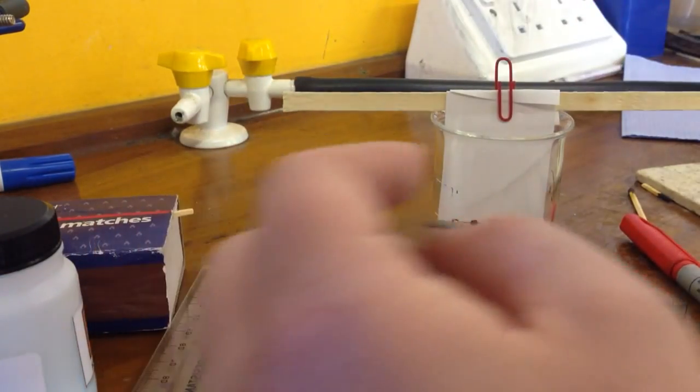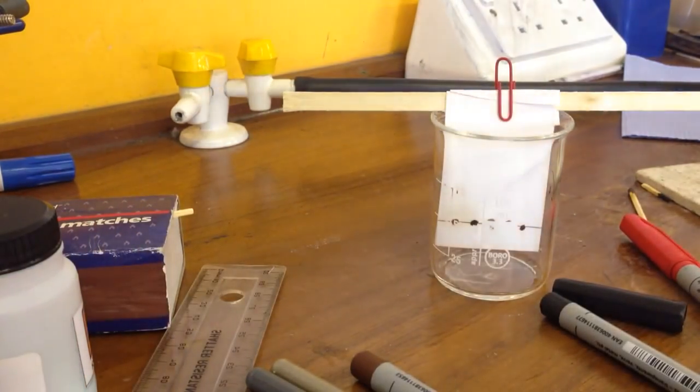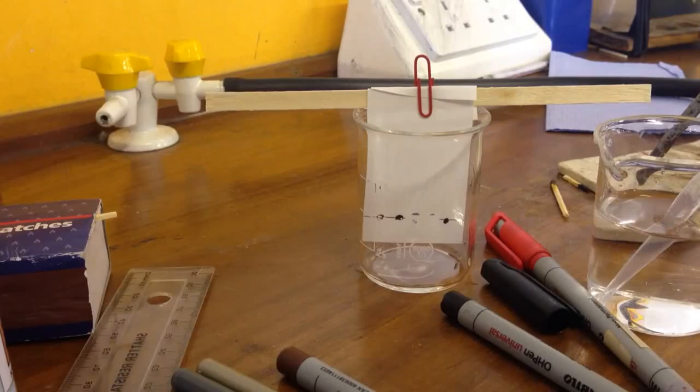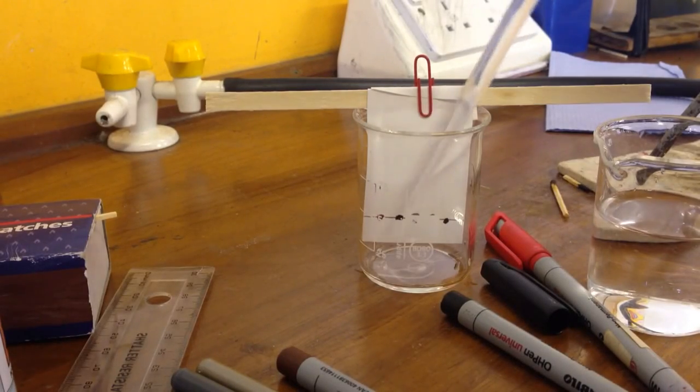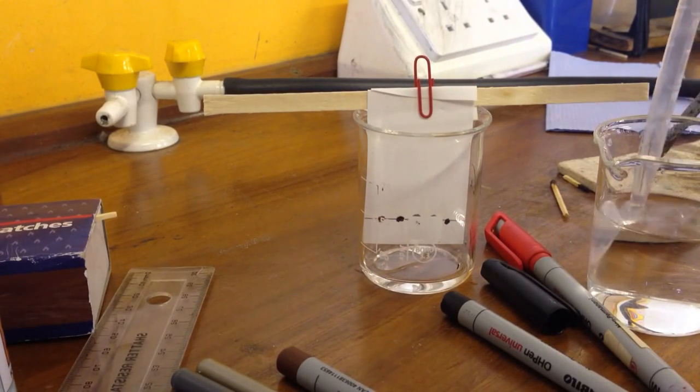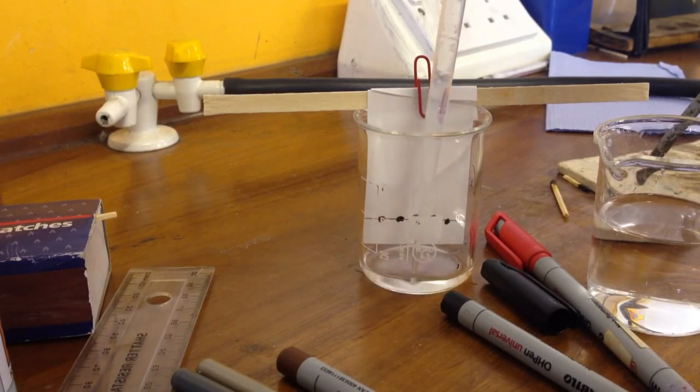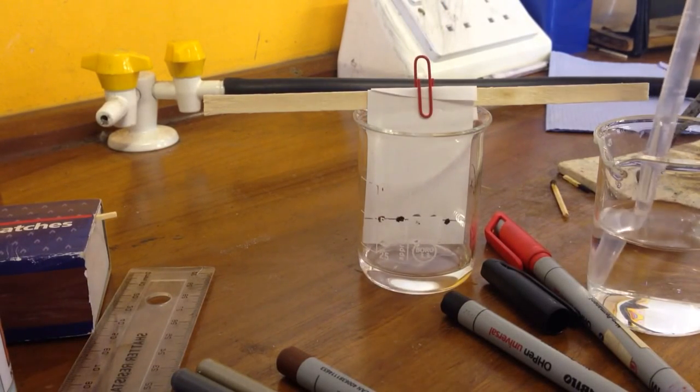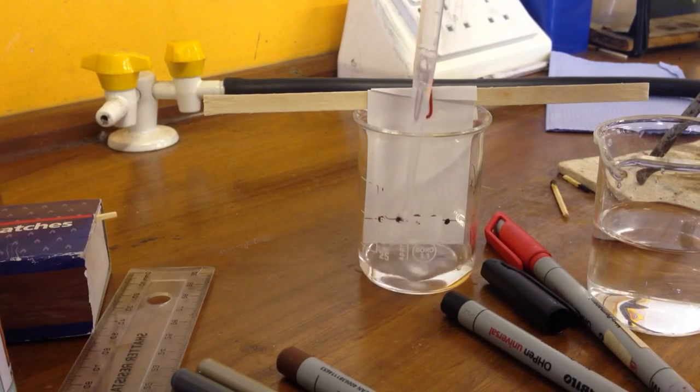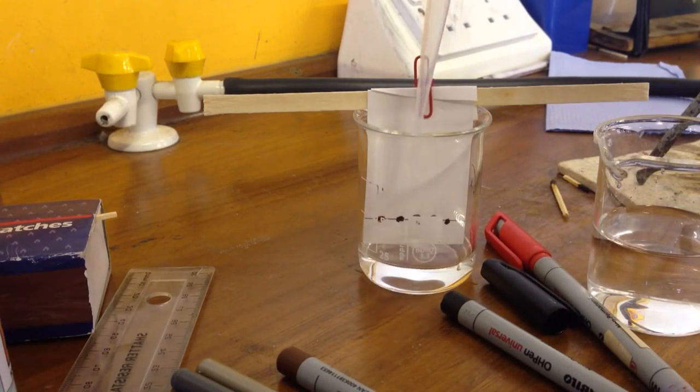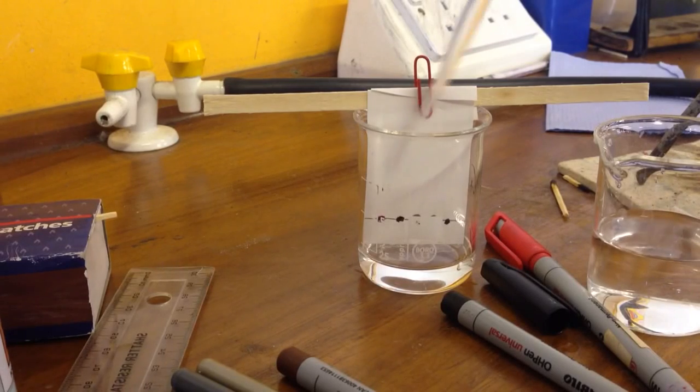Pop that in there and then I'm just going to fill it up with a bit of water. I'm just putting it in with a pipette. You need to be really careful when you're adding your water so you don't get your filter paper absolutely soaking wet. But you want your water level to be between the bottom of the filter paper and the pencil line that you've drawn.